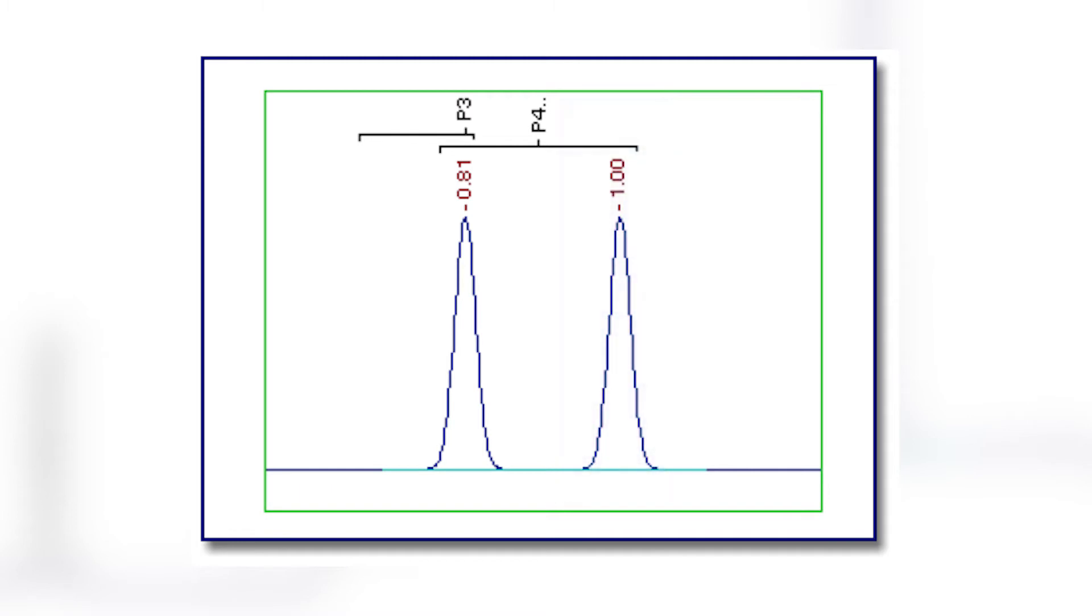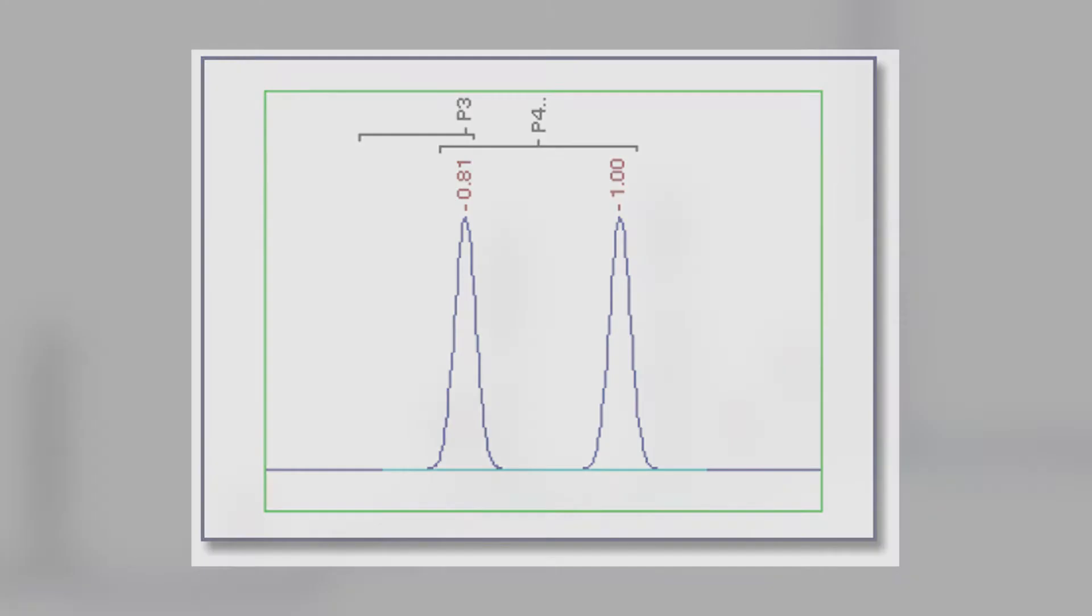If the first peak were to elute earlier, say at 0.79 minutes, then the second peak would be identified. These problems cause erratic behavior because the result depends on slight differences in retention time and on the presence of other peaks.